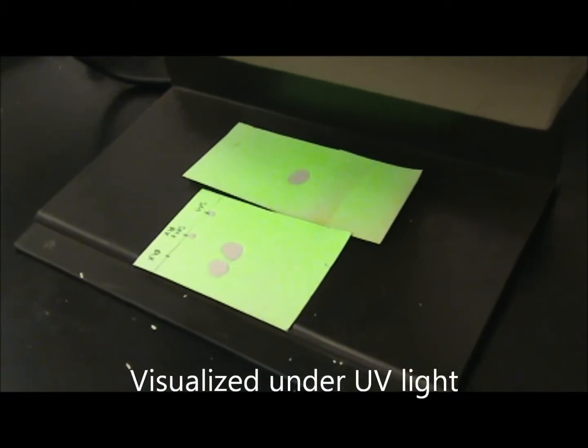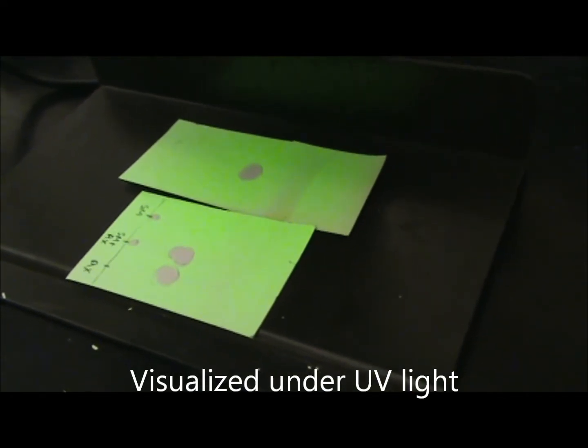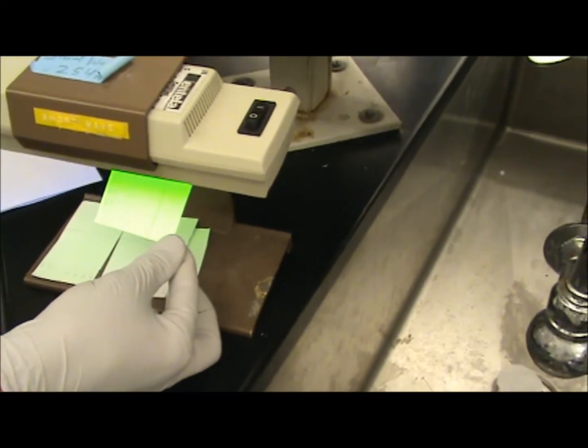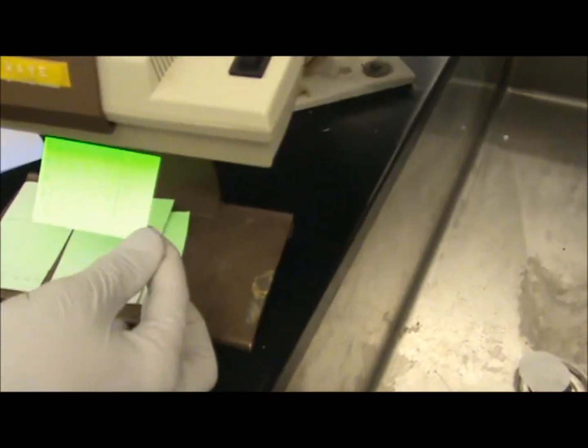I don't know. This is their awesome TLC plate. It doesn't show up very well on camera now. So what we have here is we have our Bach protected tryptophan methyl ester. What do you think happened to 26? There's two things in 26. Hence the two spots.